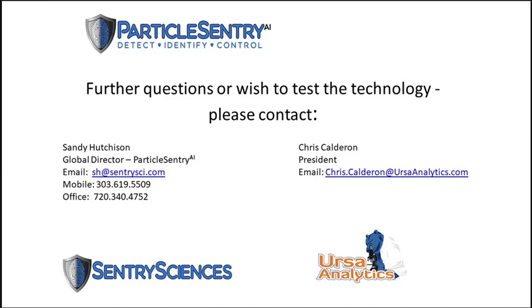So could that question be clarified? Is this from a panelist? So the imaging device, the flow imaging device, is measuring these. You've got a vial of product that you'd like to inject through the FlowCam in our particular case. You have a syringe and then you inject that into the flow cell. Then it just measures all the particles that are in the stream in the flow cell, images each one of them, and that's how we get our input data for these techniques.